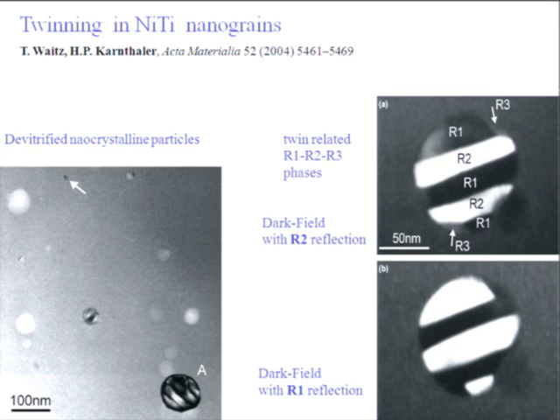These people started from an amorphous state, de-vitrified the specimen and obtained these lovely little gemstones, which can have this pattern if certain diffraction spots are selected and dark field images are made. You can very clearly see the twin planes.